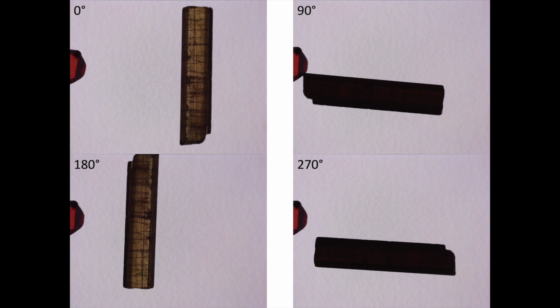One color is a light yellowy green, and the other is pretty much completely dark. Once again, our plane polarized light in this image is vibrating in a north-south direction, and that's important for our color scheme here. If the plane polarized light were vibrating in an east-west direction, the color scheme would just be changed by 90 degrees. So our tourmaline crystal is showing us pleochroism, and let's go a bit more into theory to explain why that might be.